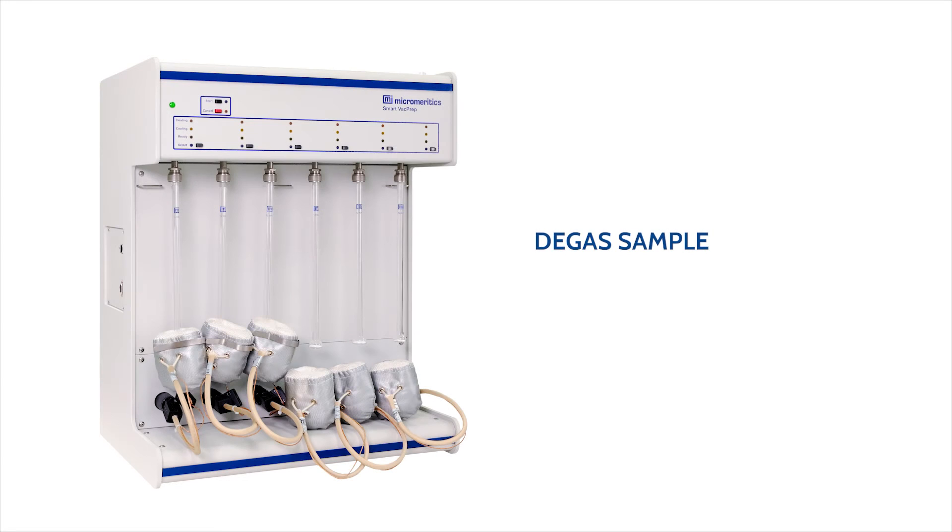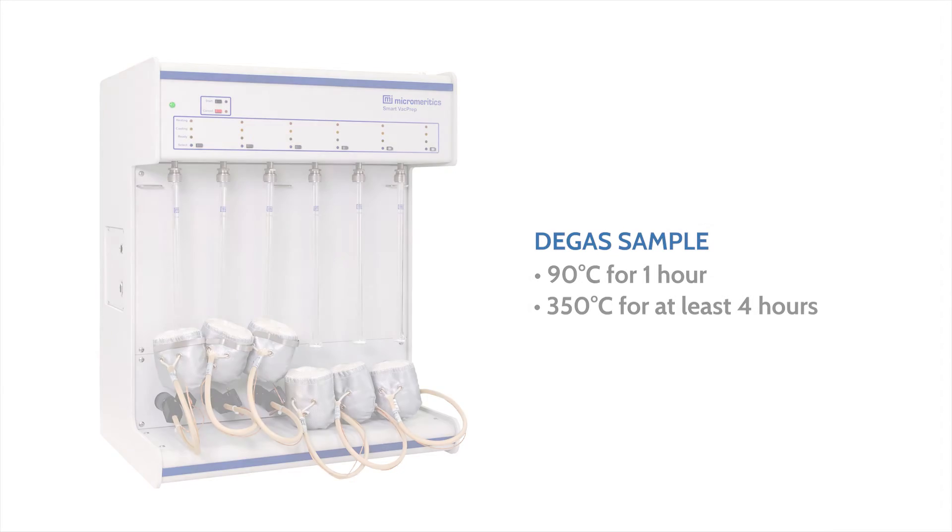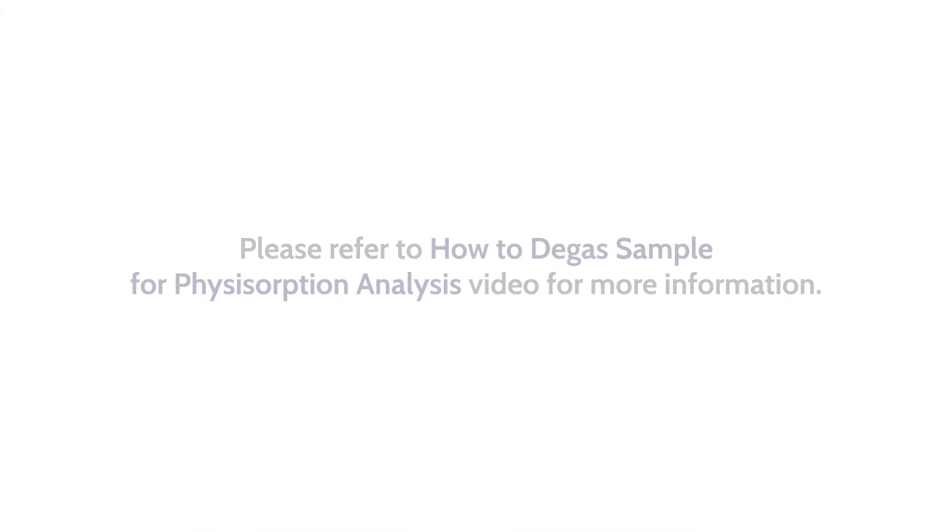Degas the sample at 90 degrees Celsius for one hour and then 350 degrees Celsius for at least four hours on a separate degas unit. Please refer to how to degas sample for physisorption analysis video for more information.